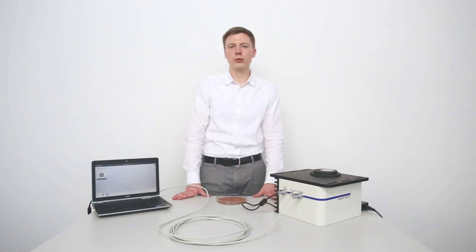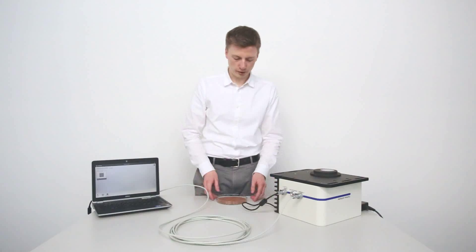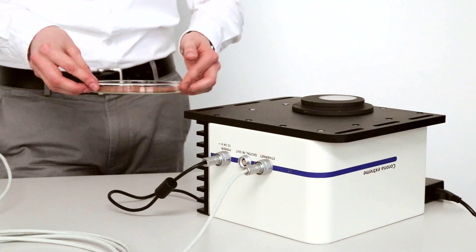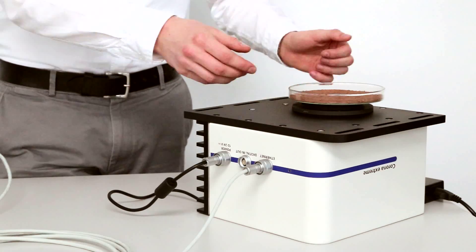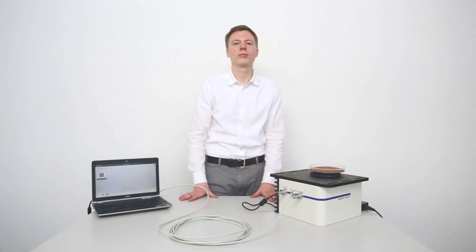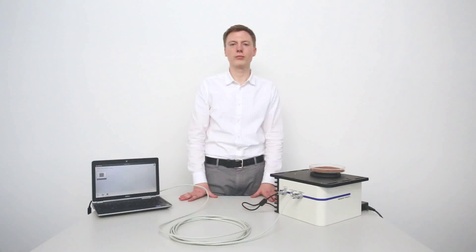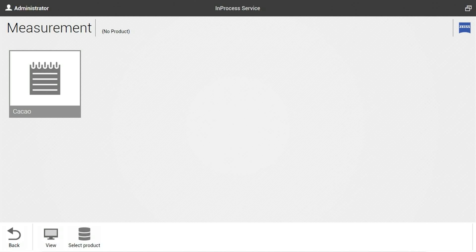Before starting the measurement we have to set up our sample. Now that the sample is set up we are able to select the Cacao product from the measurement view.